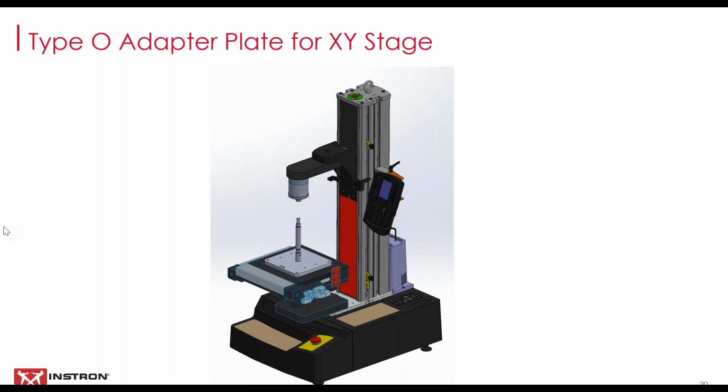So the last question I have here is: is it compatible with existing 5900 and 5500 systems? So the XY stage is compatible with all existing 5900 single column frames as well as extra wide dual column frames. It is not compatible with 5500 frame controllers. However, if you have a 5900 retrofit on your 5500 frame, then it will be compatible with that.